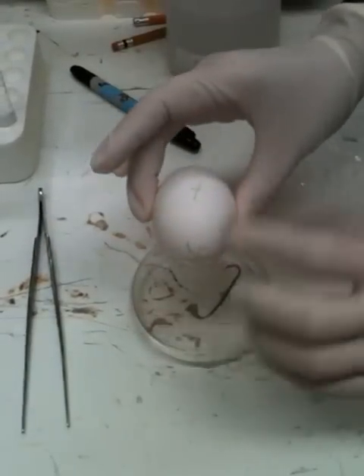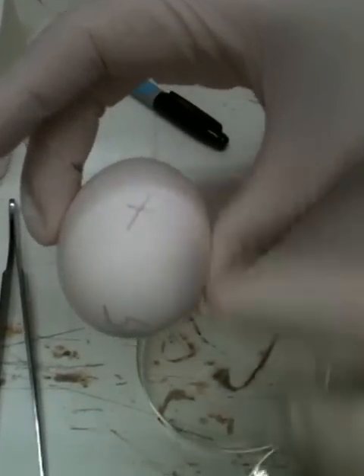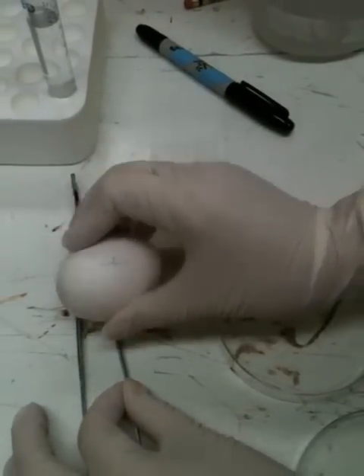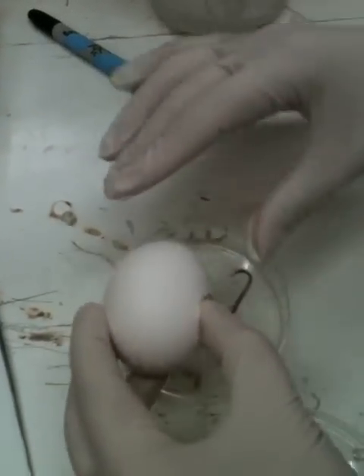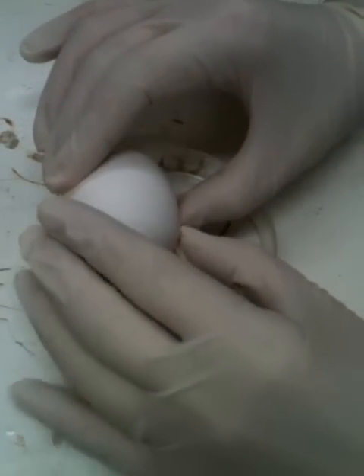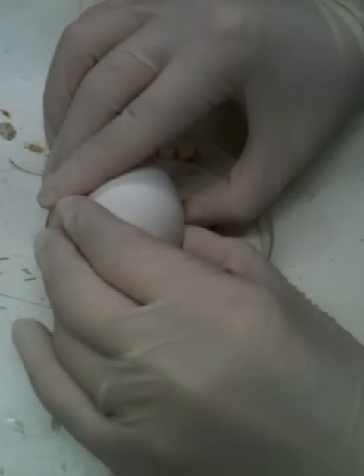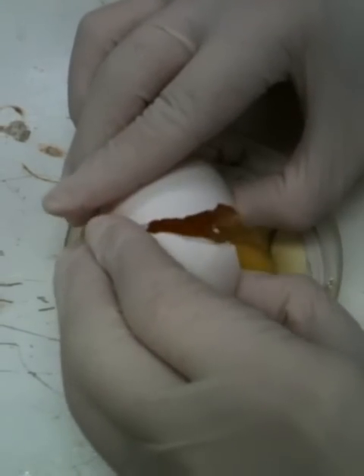Hold the egg with the pencil mark on top, and gently crack the egg on the forceps. Put the egg close to the bottom of the dish and gently separate the halves of the shell.